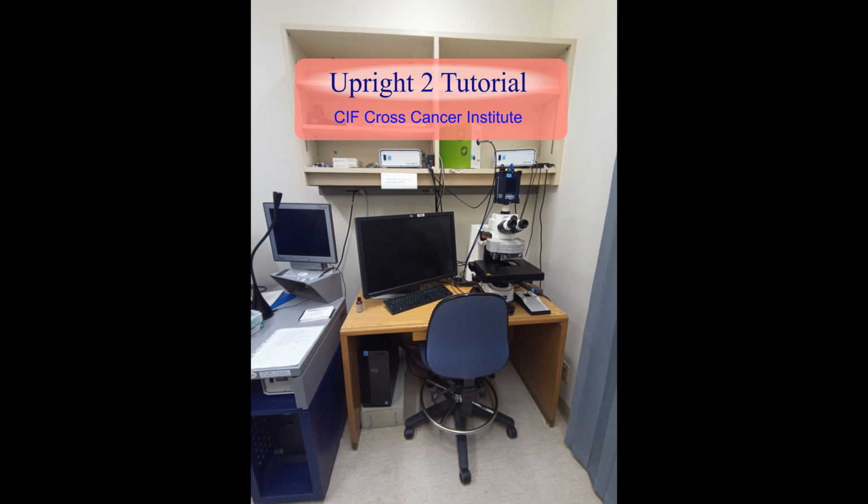Welcome to the Upright 2 tutorial for the Cell Imaging Facility Core at the Cross Cancer Institute. In this tutorial you will learn about the startup and shutdown procedures as well as how to use the microscope and acquire images using the software Metamorph.